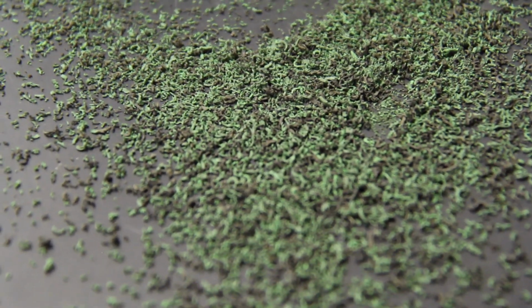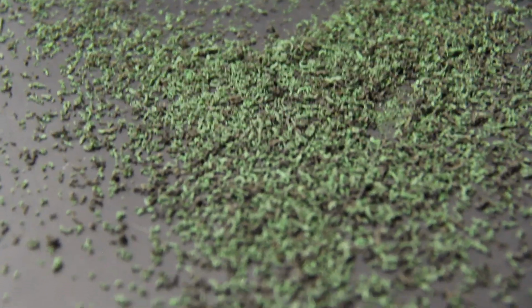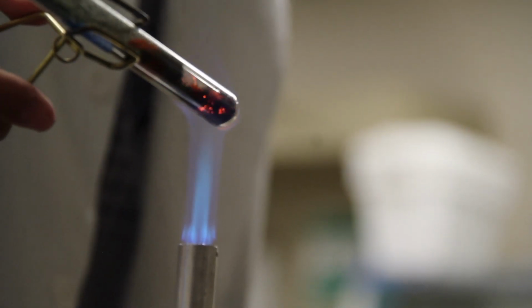As you can see, chromium-3 oxide is a flaky green substance that has a considerably larger volume than the original compound.